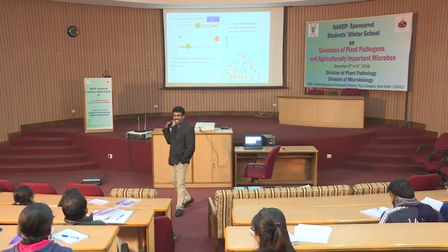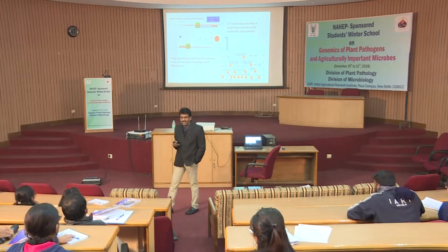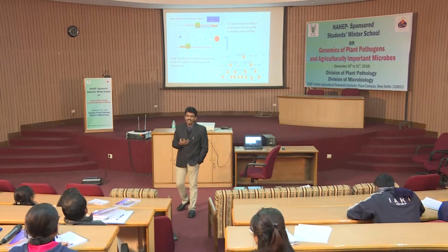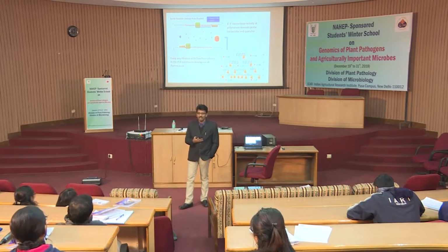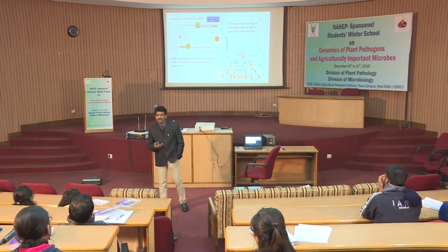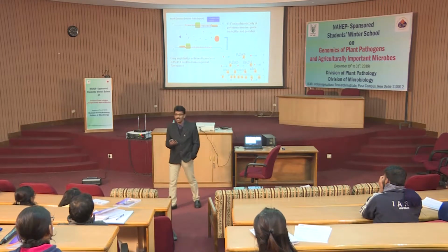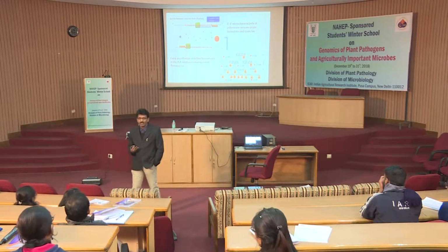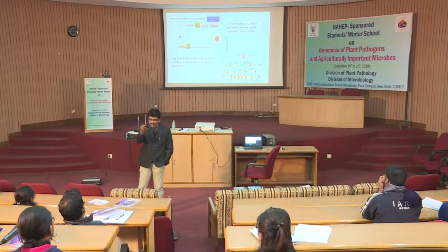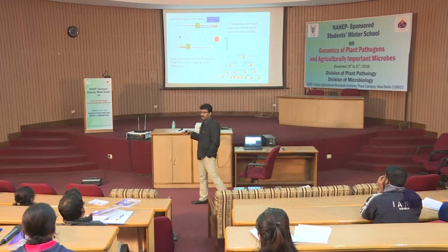So we'll take that in a few slides, and also more so in our practicals. We will be demonstrating how to convert the Cq values into copy number, right? We have a practical lined up tomorrow, that is absolute quantitation of a target. So, how to convert the Cq values into the copy number. That is an exclusive practical we have. We will discuss that point. Okay, you wait till that point of time.